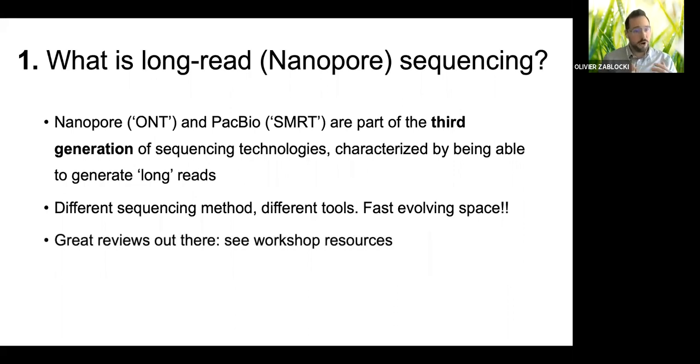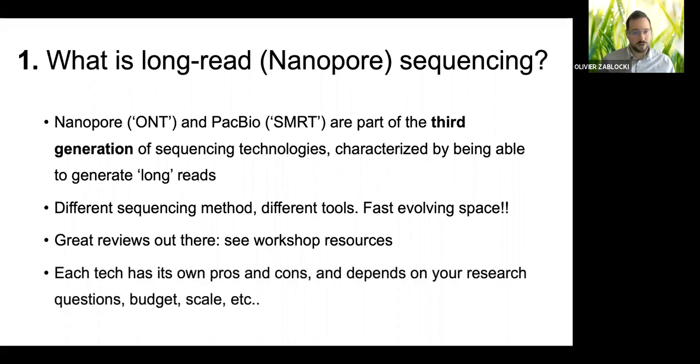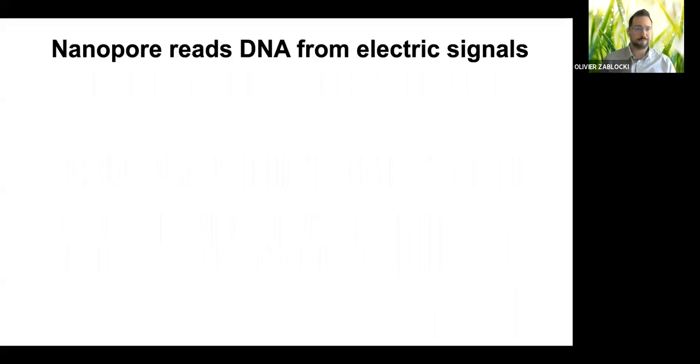We will focus today on Nanopore, and full disclaimer, I don't work for Oxford Nanopore. I'm not a sales rep. I invite you to go and read some great reviews out there that describe the pros and cons of these technologies and explain in a lot of detail how they work. This could help you focus on how this can help you. A lot of it depends on your research questions, your budget, and the scale that you're looking for, and based on these factors, you can choose what's more appropriate for you.